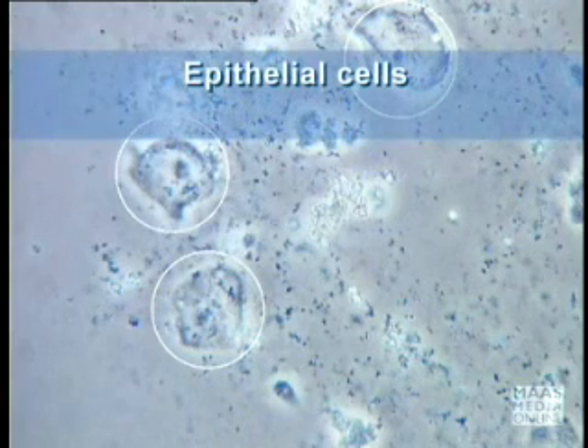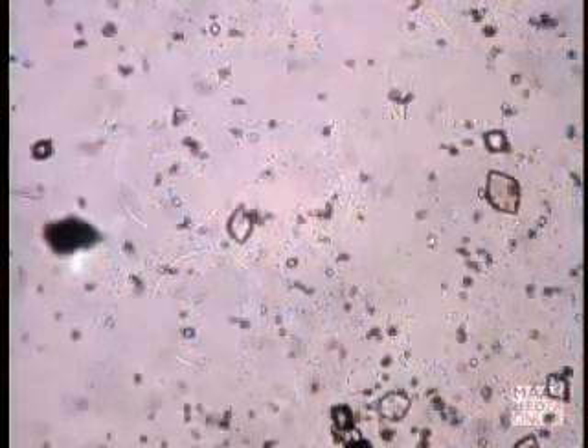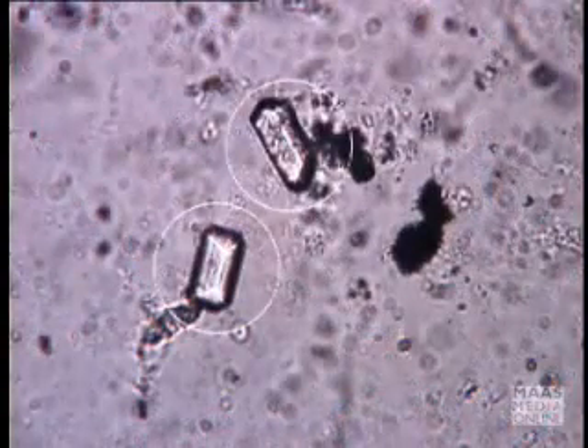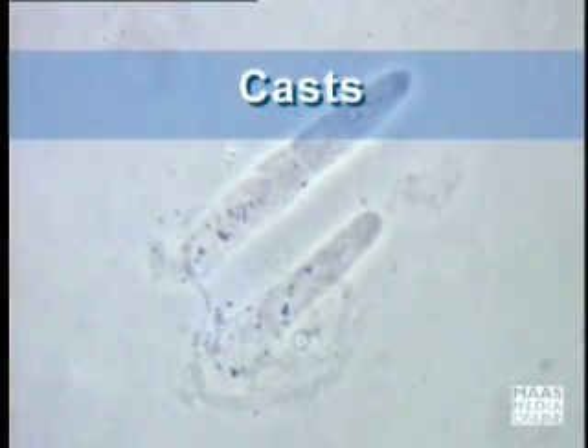She is looking for epithelial cells, which, if present, would suggest vaginal contamination. She is also looking for crystals and casts.